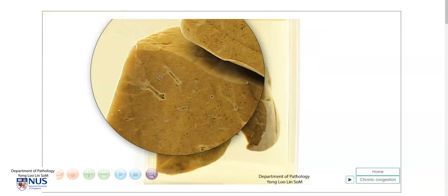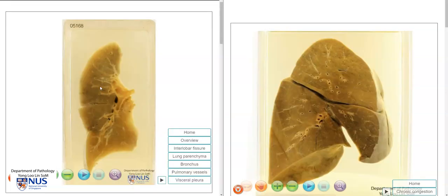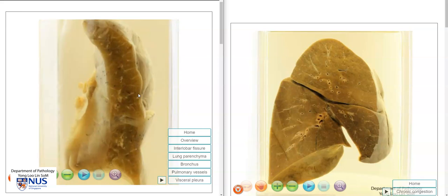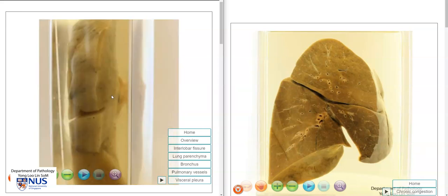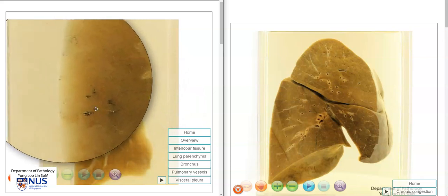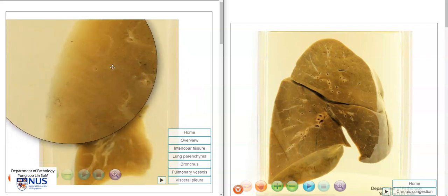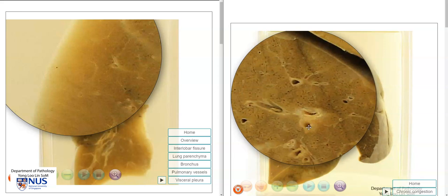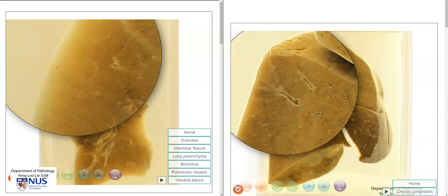What is actually wrong is that the lung parenchyma appears abnormally solid and it also appears darker brown than usual. To fully appreciate this, it is best to compare with a normal lung. On the left, we have a normal lung — here is the cut surface and the visceral pleura. It's usually very spongy and almost translucent at the edges. Magnifying it, we can see that it has this very light, spongy look. Comparing directly with the abnormal lung on the right, the parenchyma looks a lot more solid and slightly darker brown in colour.